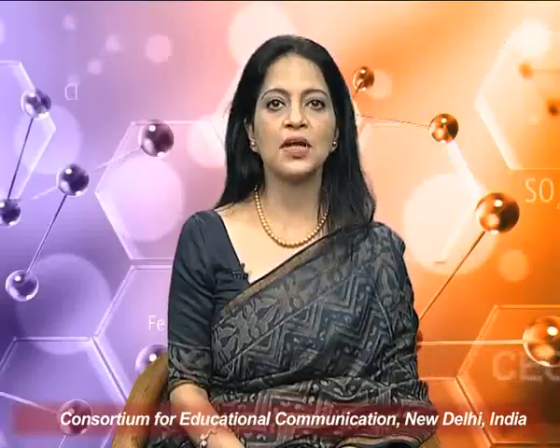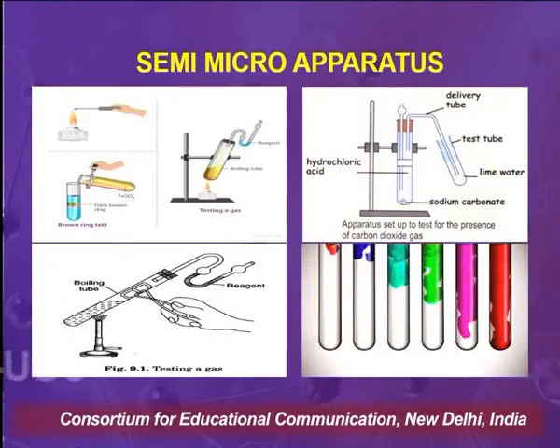These are some of the apparatus used in semi-micro analysis, wherein semi-micro test tubes are used, which are much smaller than the normal test tubes. The normal test tubes used in laboratories are of 10 ml. These test tubes are much smaller, maybe 2 to 3 ml, and the other apparatus, as you can see from the figure, are also on a much smaller scale.